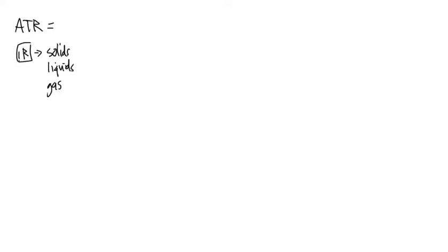But in the previous videos, I told you that there is another method that we can use if we have some extra money to spend on an IR instrument. And this is called the ATR attachment. The ATR stands for Attenuated Total Reflectance.